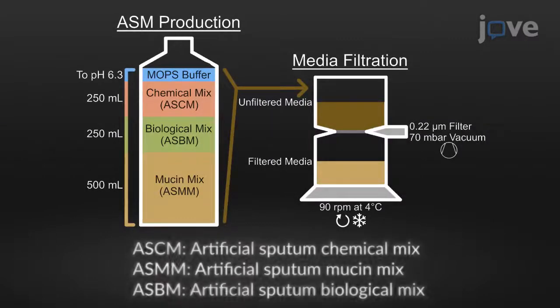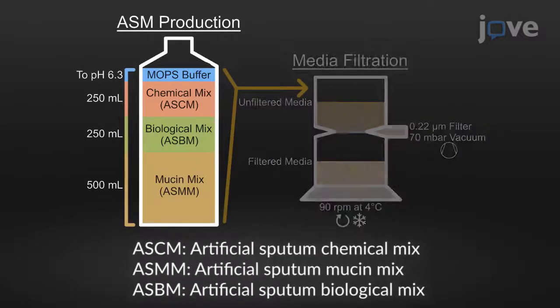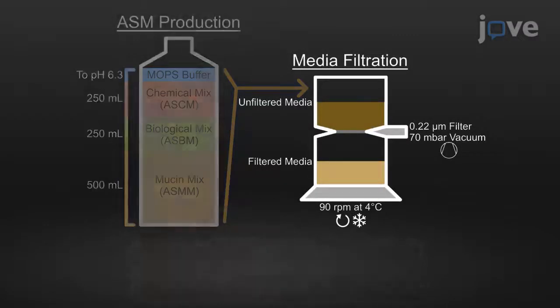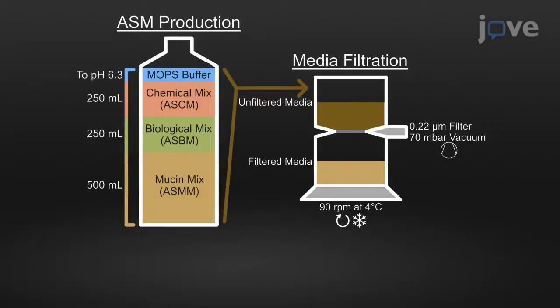An overview of the steps for artificial sputum medium preparation shows the mixing of the prepared ASCM, ASMM, and ASBM. The MOPS buffer is used to titrate the pH to 6.3, and filter sterilization of the medium is carried out in a cold room on an orbital shaker.